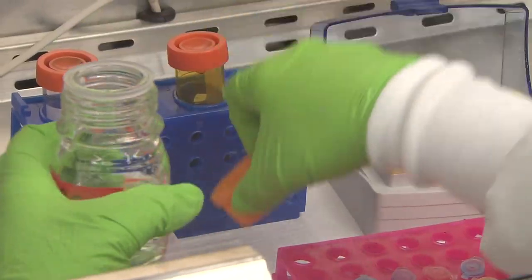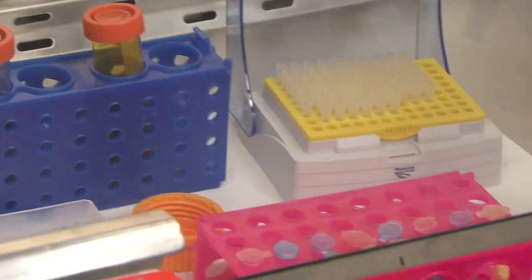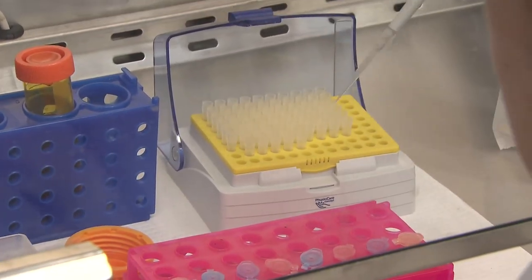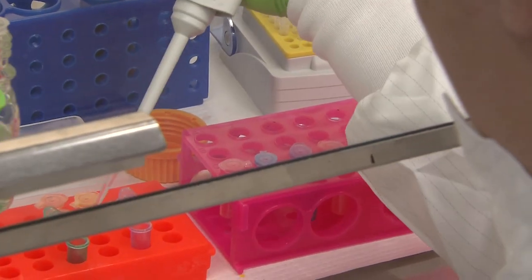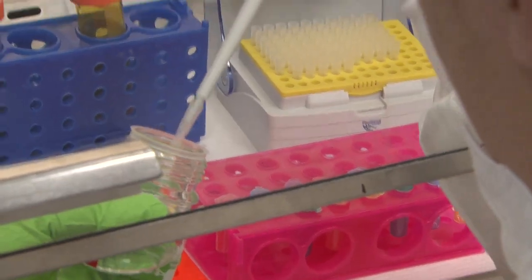You would do all your work inside that biosafety cabinet, and the directional airflow creates kind of an air curtain plus inward directional airflow to keep the microorganisms inside the cabinet. And then all air coming out of the cabinet goes through those high efficiency particulate air filters to keep the room and the environment clean as well.